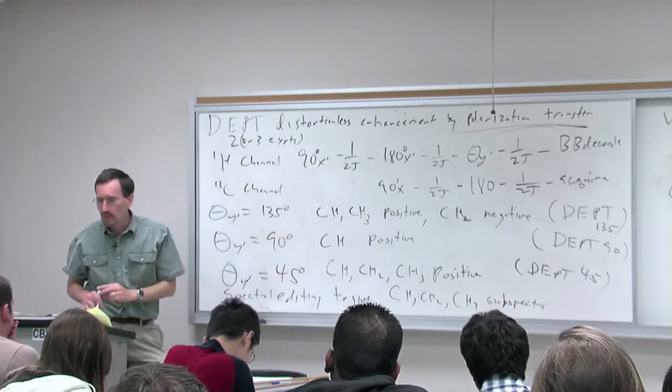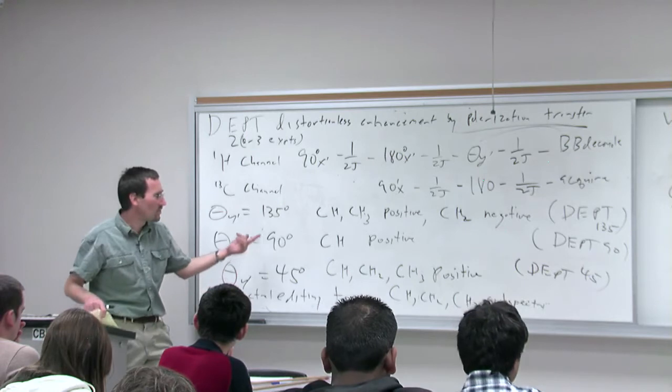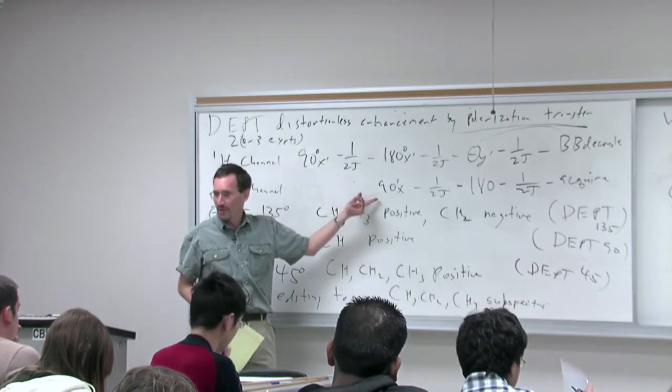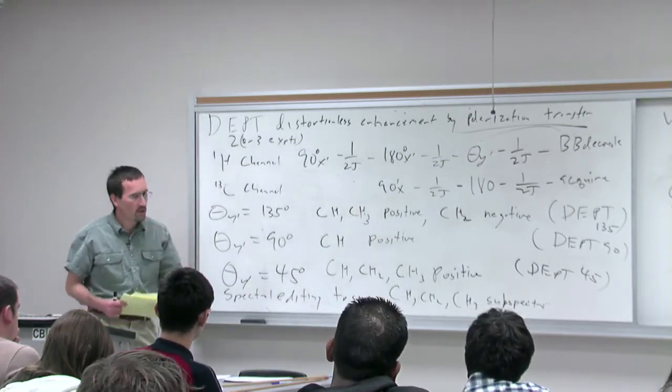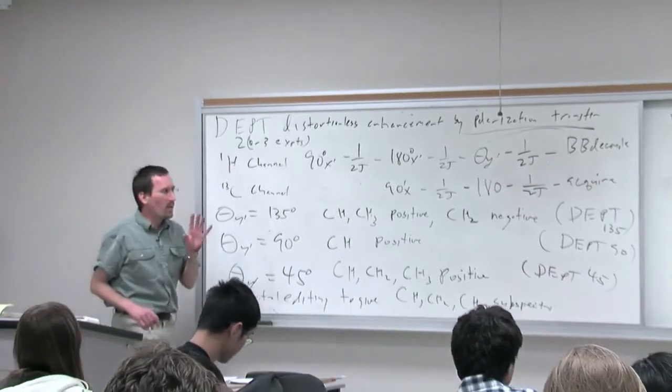In practice, it doesn't work so well, and it's messy. And given the fact that it's really no big deal to stare at your DEPT 135 and stare at your DEPT 90, people generally don't do it, but you can do it as well. Anyway, that pretty much sums up what I want to say.